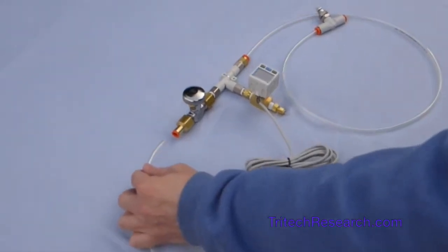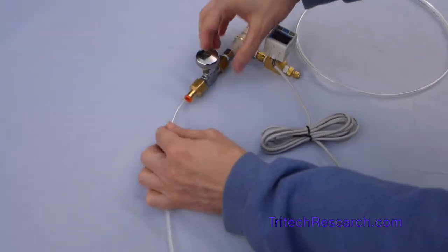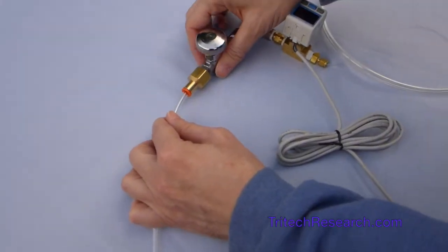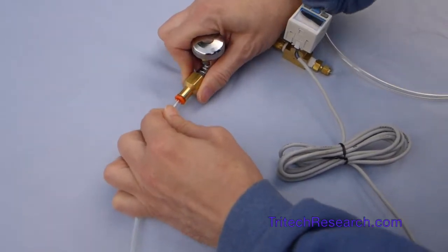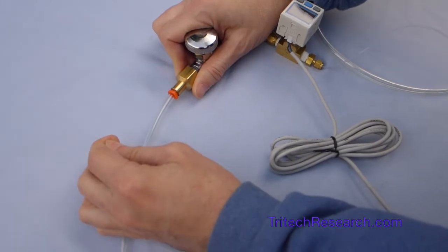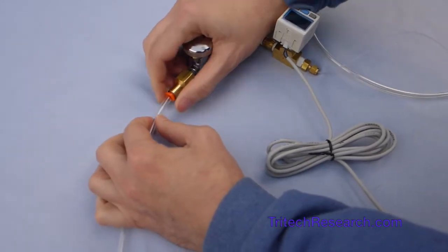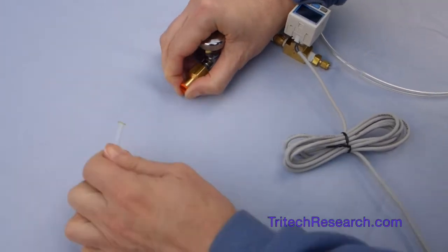So first we'll attach a positive pressure source into this quick connect. You push it in a little ways and then you'll feel some resistance and then you push it in farther, and when you try to pull it out it's locked into place. If you ever need to remove it you hold the ring in and pull it out.